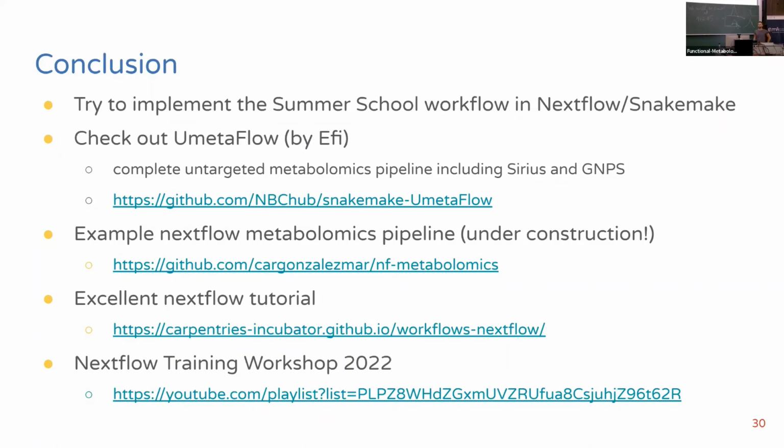What is your experience with onboarding new people who might have no or limited experience with coding? Yeah, it's of course a little challenge, but if you follow, let's say, for a total beginner, that tutorial here, it's really great. So you can get into it. Of course, you need to put in some effort, but even if you have no coding experience yet, you could easily link together some tools, make a very small workflow and get used to it.